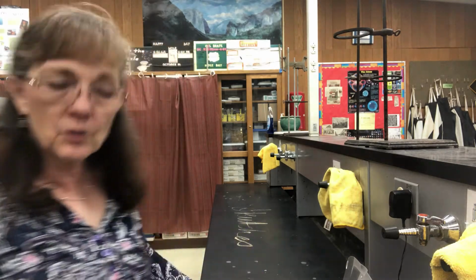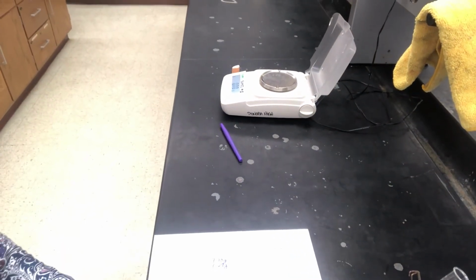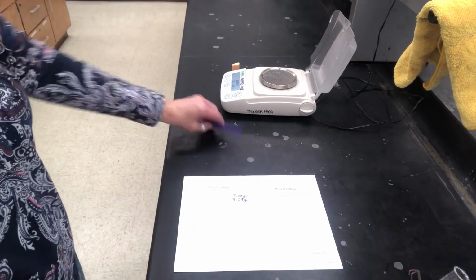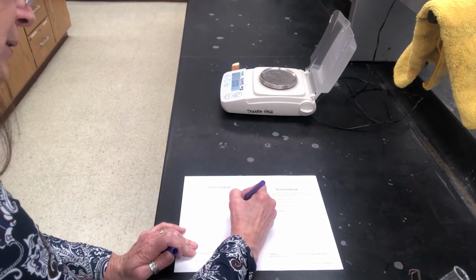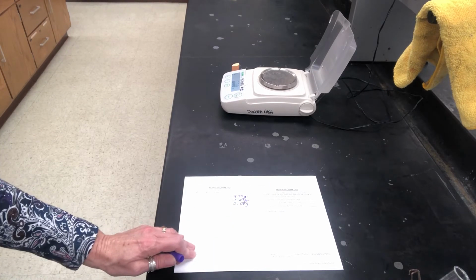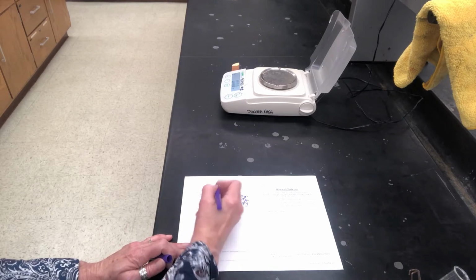We do some calculations. Hopefully I can figure out how to make this thing work, and hopefully it makes sense to you. So I'm finding it. Hopefully that's there for you. 7.33 grams to start, 7.29 grams to finish. You can probably figure out that's 0.04 grams of chalk.